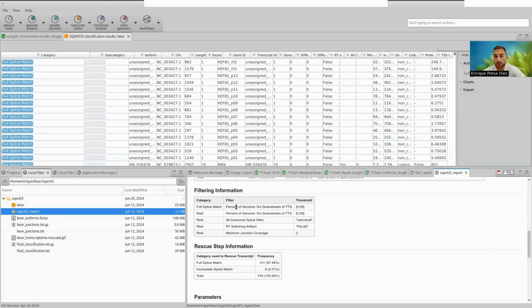That is because inside the transcript there are a lot of adenines, so the poly-dT that is used to bind the polymerase might be bound there. So it might be some kind of transcript that is actually an artifact.